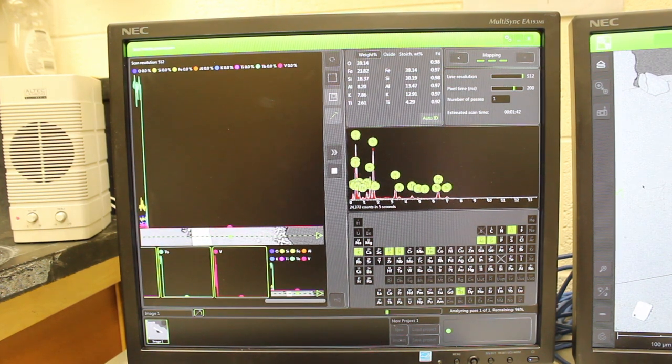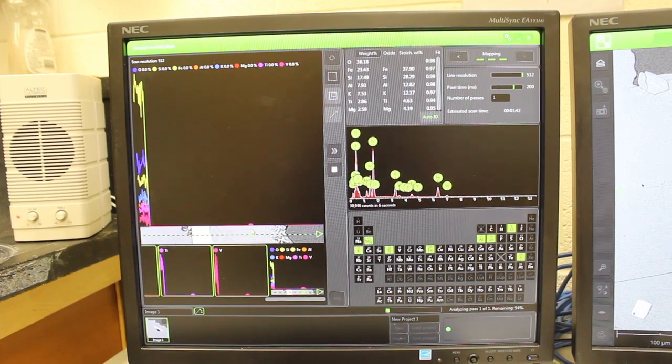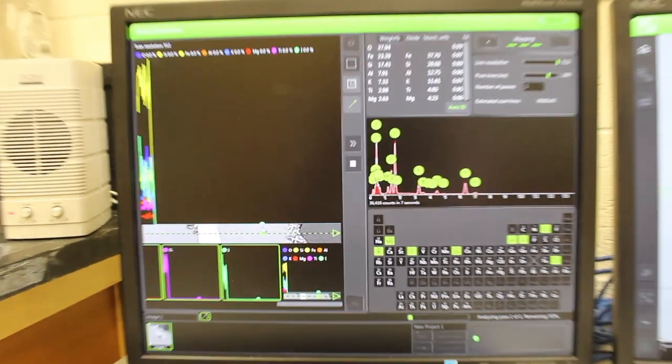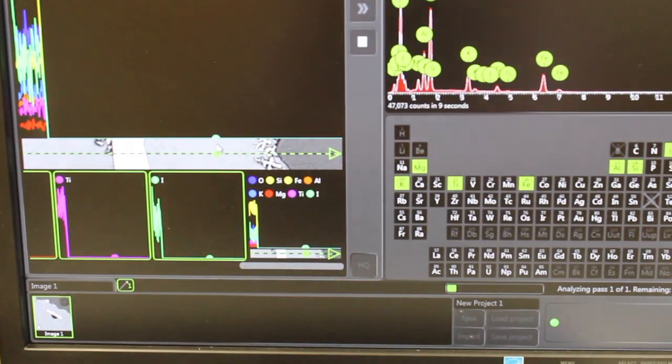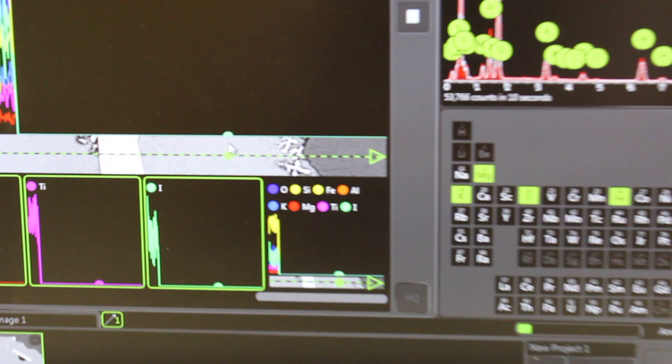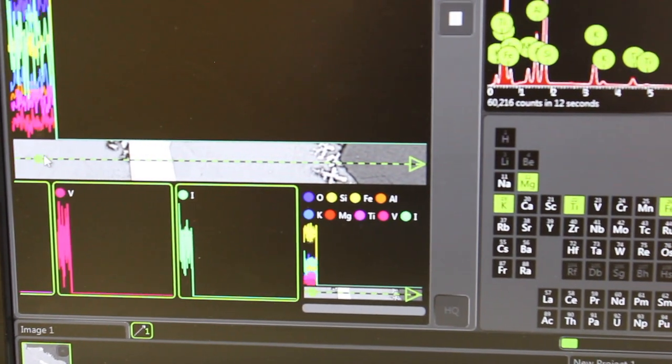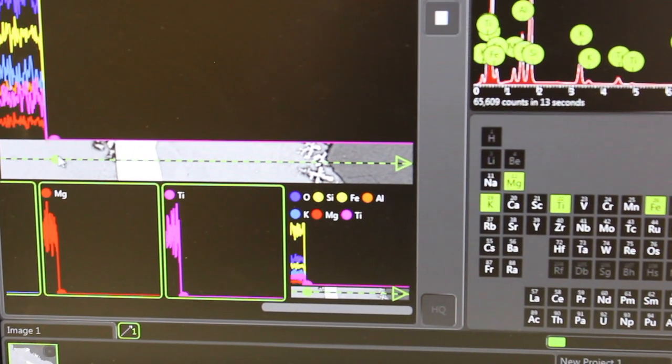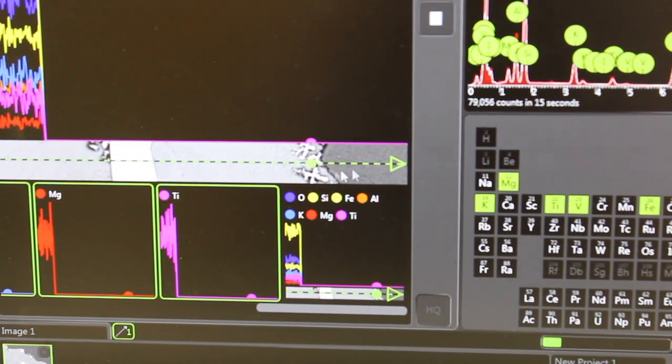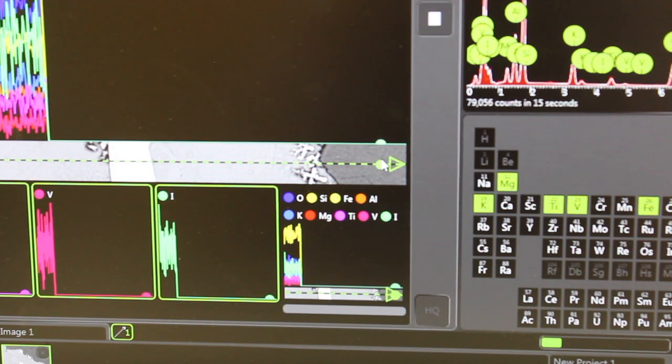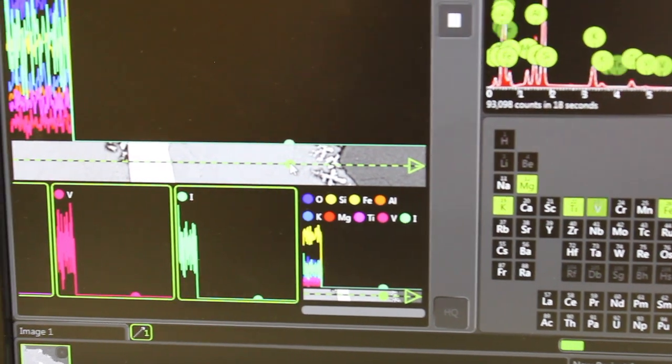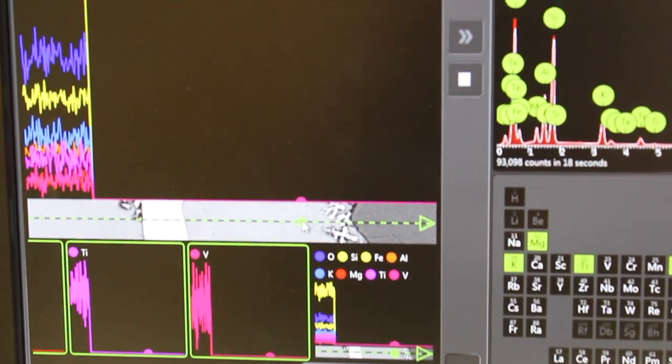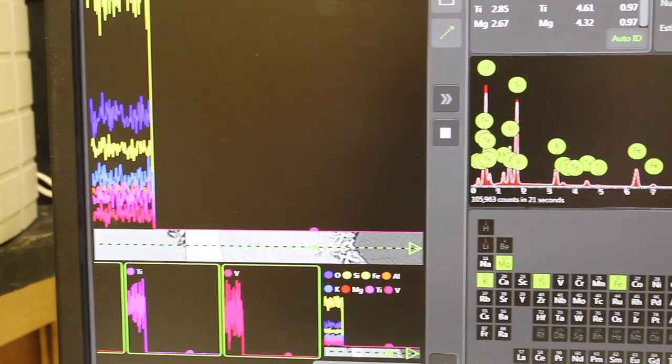So you can hopefully see this part here, let me zoom in. Right here is a slice of the backscattered electron image showing your transect, and the data as it's collected across the transect is plotted above it.